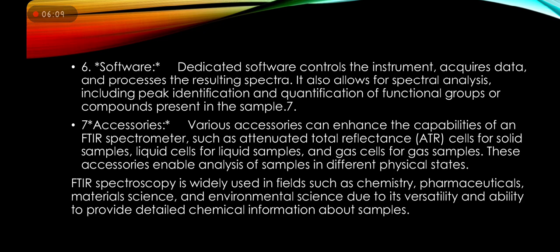These accessories enable analysis of samples in different physical states. FTIR spectroscopy is widely used in fields such as chemistry, pharmaceuticals, material science, and environmental sciences due to its versatility and ability to provide detailed chemical information about samples.